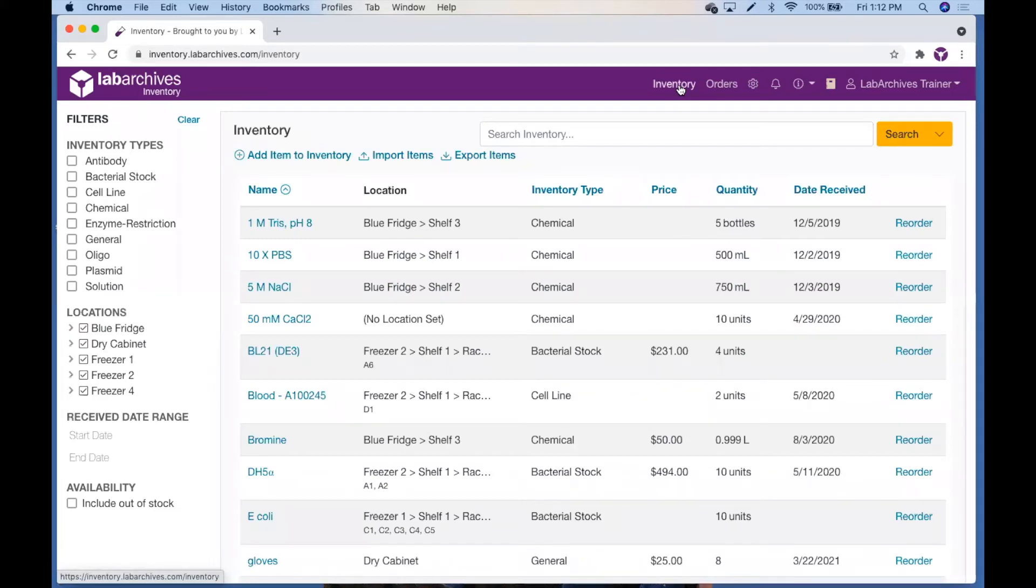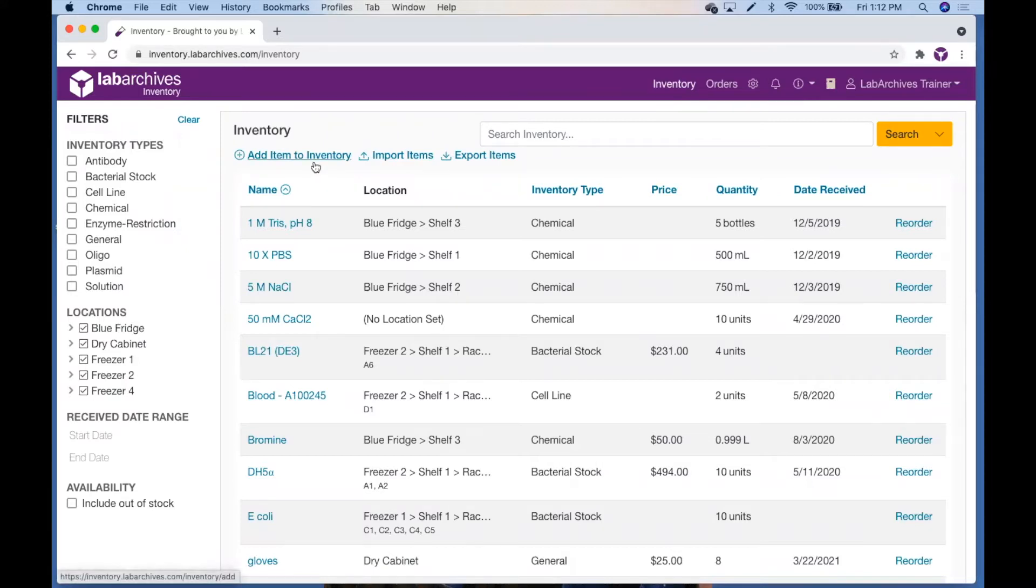If you have permission to create items and add to inventory, you will see this Add Item to Inventory option. Clicking this will bring you to the Add Inventory Items screen.